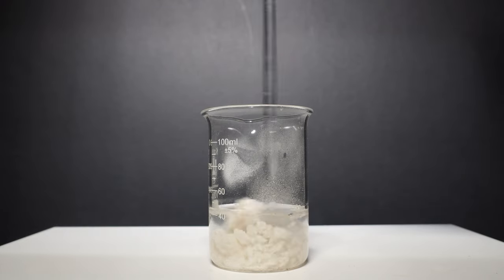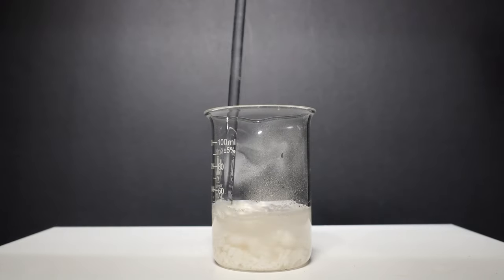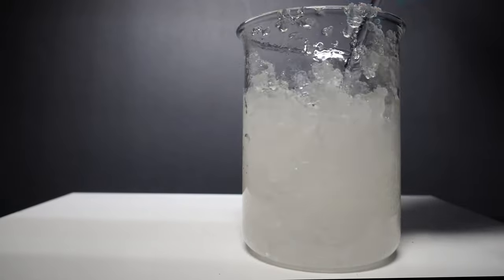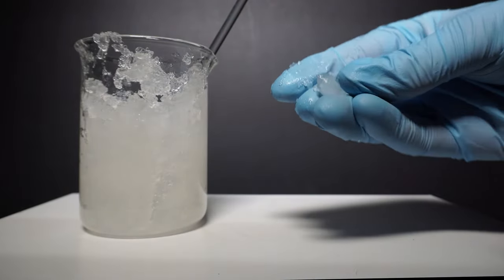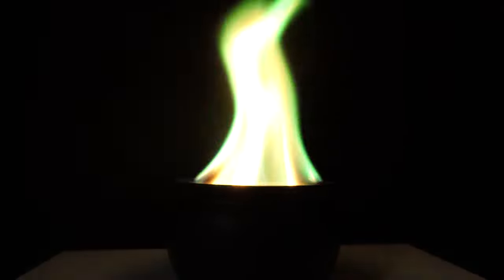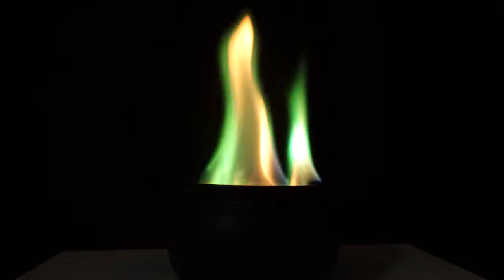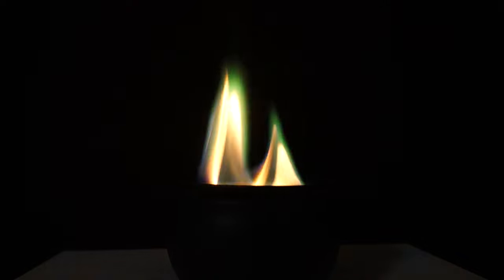In today's video I'm going to be taking some calcium acetate I made in the last video and turn it into some flammable jelly. I will then add additional compounds to make the fire burn different colors. I will also be announcing who won my last video at the end so make sure to stay tuned.